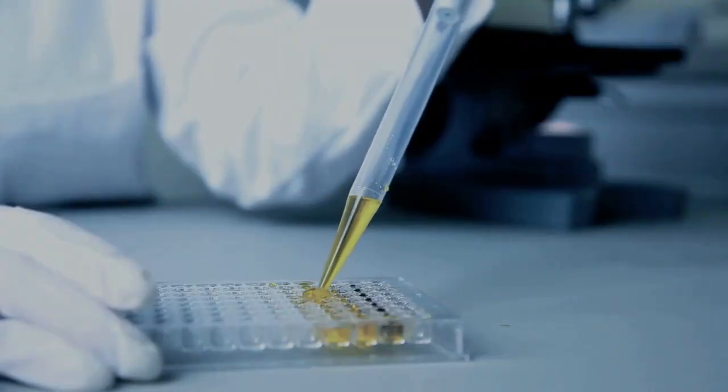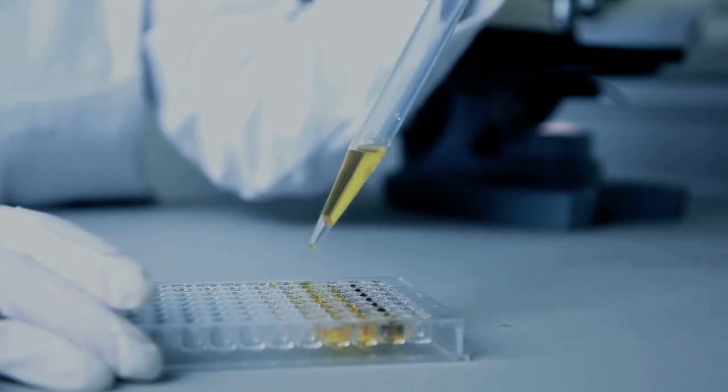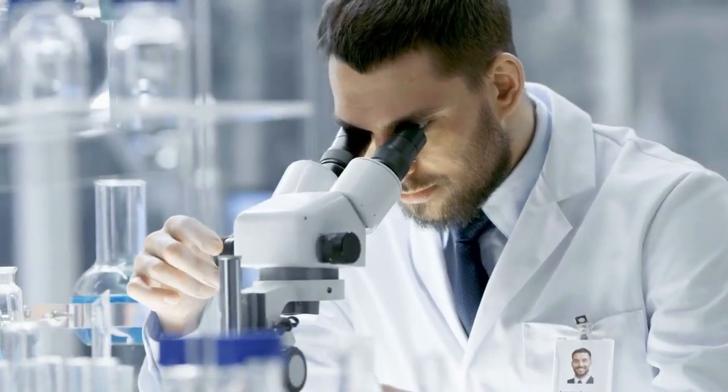Let's start with the one thing they have in common. Both methods need to take a sample, which is often a liquid, and turn it into a hot gas of individual atoms. Think of it like a superfine mist being sprayed into a flame. This process is called atomization, and it's the crucial first step for both. Now, here is where they split into two different paths.